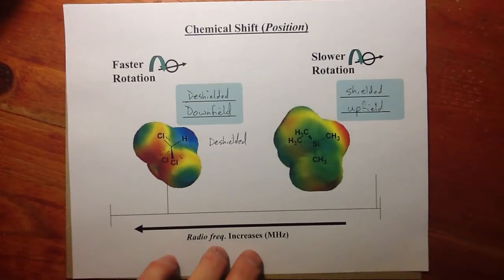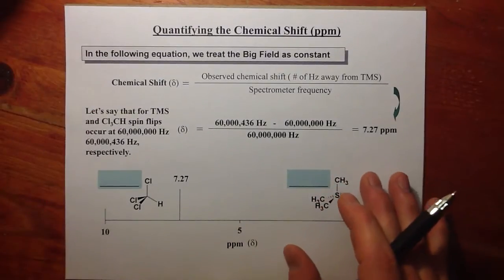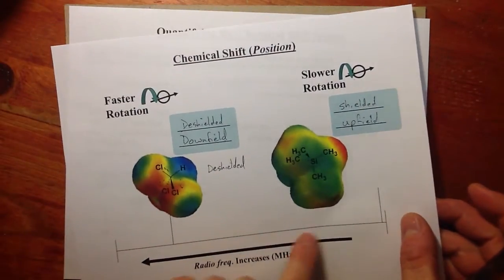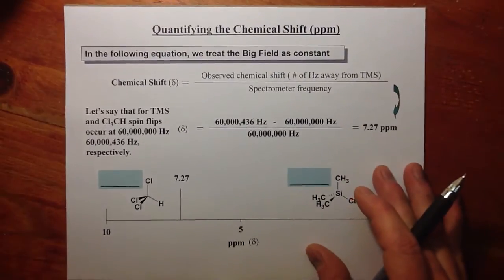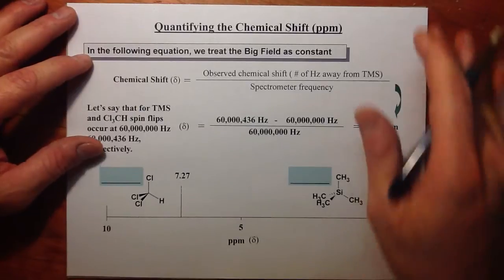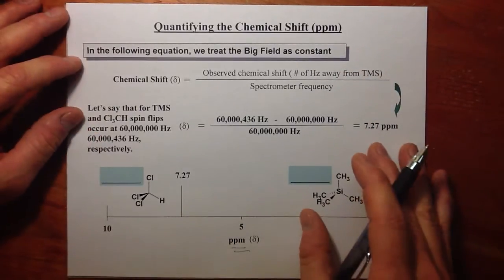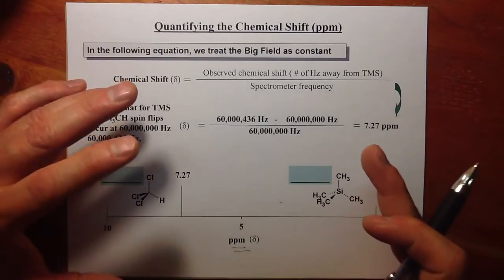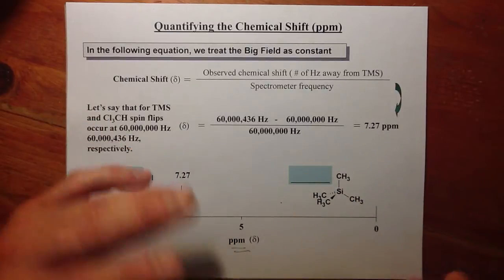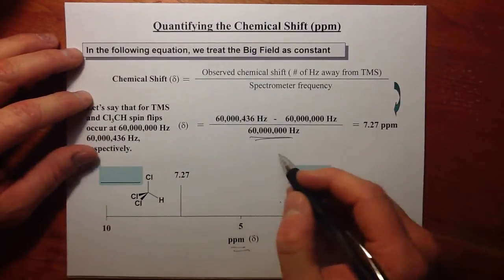We're going to change the way we describe this x-axis. We're going to take away this concern about the exact precession frequency we have measured at any particular point on this x-axis. How do we do that? How do we make it measured in just ppm? Well, what we do is we treat every magnet as, well, let's go ahead and talk about it now.